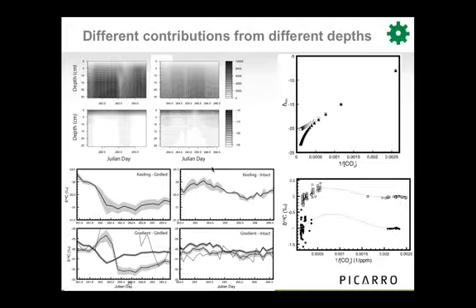And then the last thing that I want to touch on really quickly from this study is that we were able to show with this data that Keeling plots aren't always linear, basically. What we would expect from the Keeling plot is shown here in the open squares. And if your isotopic composition is not constant with depth, what you get from model results, at least, is something that looks more like the triangles on this top plot on the right. So we have a curvature in the Keeling plot which tends to bias the result quite substantially. And we were able to show that using the data from this study.